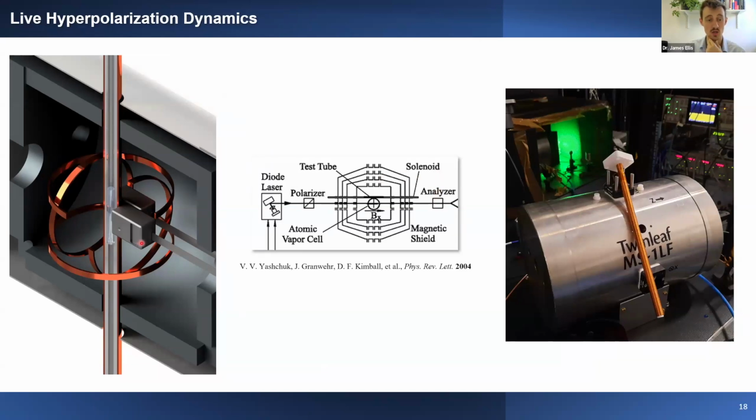The reason is that in most cases you have a detector, whether that's a magnetometer or an NMR coil, and when you're applying a magnetic field to your sample, pulsing on the spins, you saturate the detector. At high field, this means that if you're pulsing, you then need to switch off the pulse and wait a short duration before you can acquire a signal from the sample. If you were to detect while pulsing, the coil would be completely saturated. That's true as well for magnetometers for low field NMR.